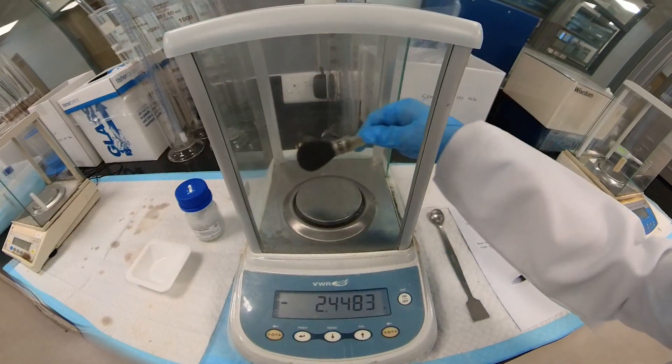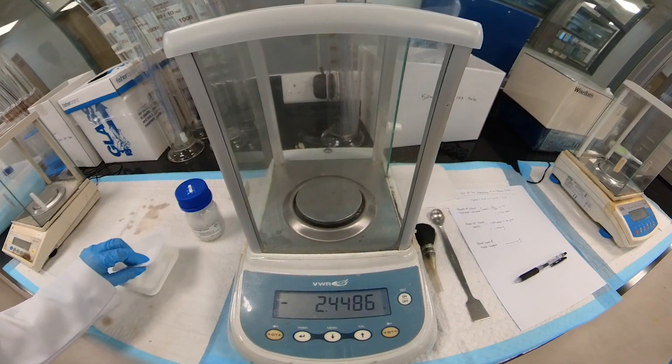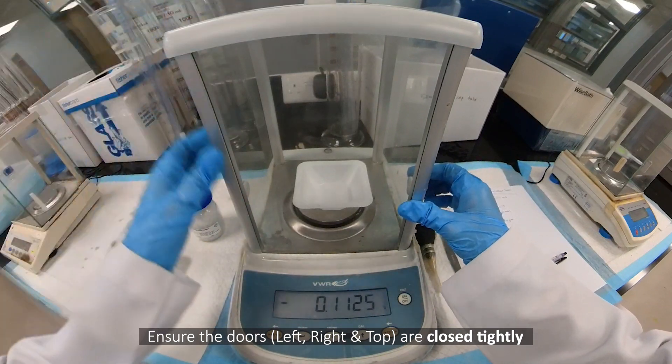Ensure the weighing balance is clean. Place the weighing boat at the center of the balance. Ensure the doors — left, right, and top — are closed tightly.